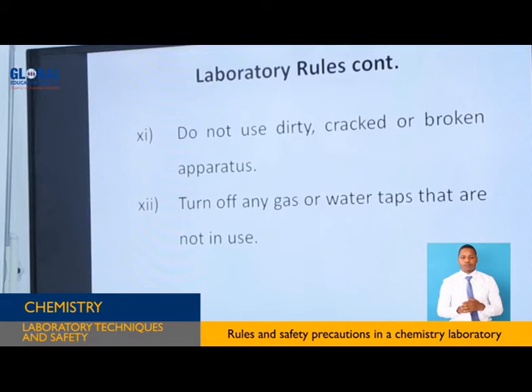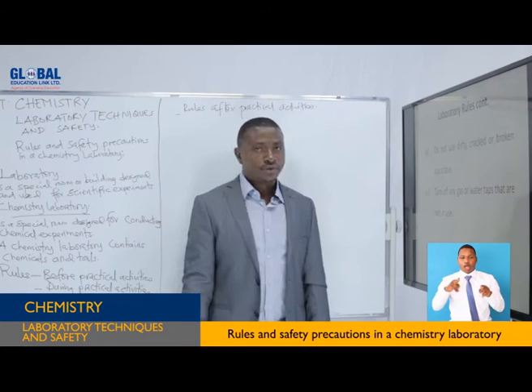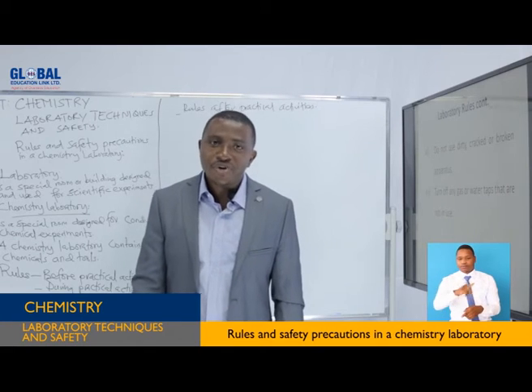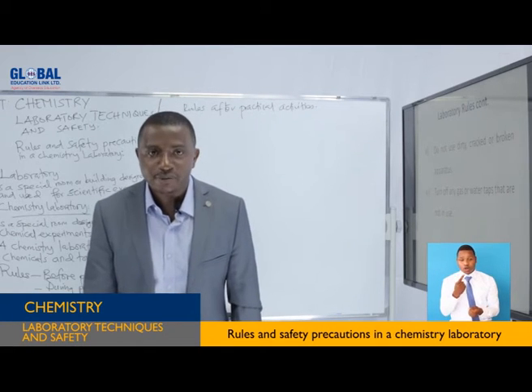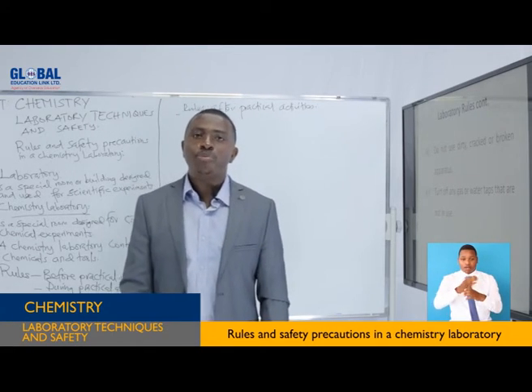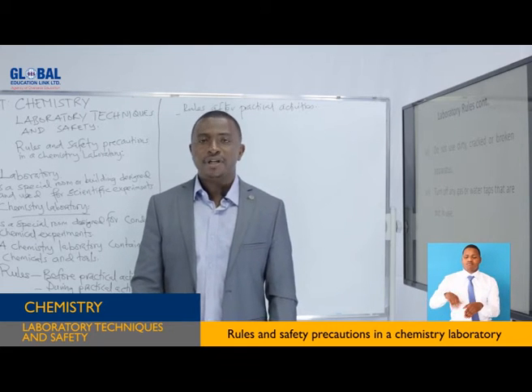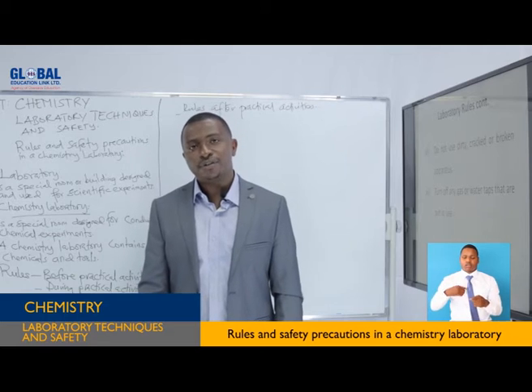Turn off any gas or water taps that are not in use. You find, students, you are in the laboratory conducting experiments, and someone opens the water tap or a gas tap and leaves with the gas flowing or the water flowing.